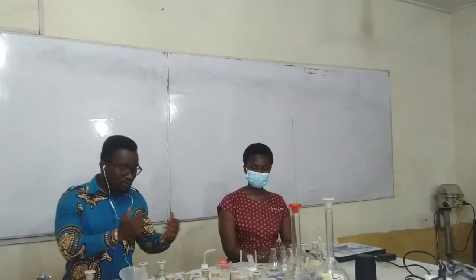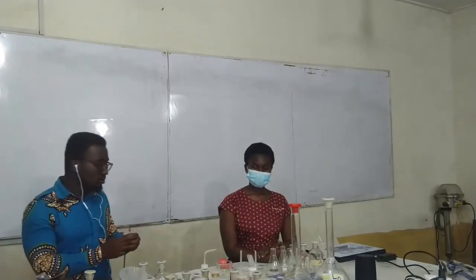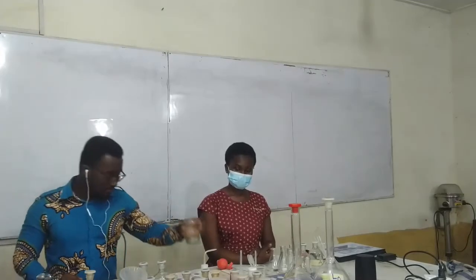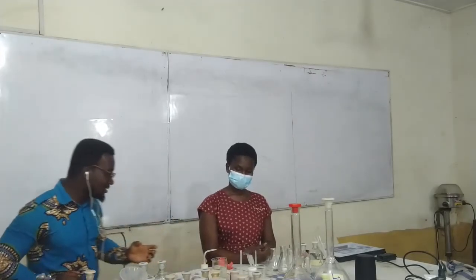So our madam will begin with how to acquaint ourselves with the pipette filler. She's going to use the pipette filler, and the pipette picks some few drops, or let me say specifically, she's going to pick 25 cm cube of this solution, which is water. So Madam Amina, it's up to you.